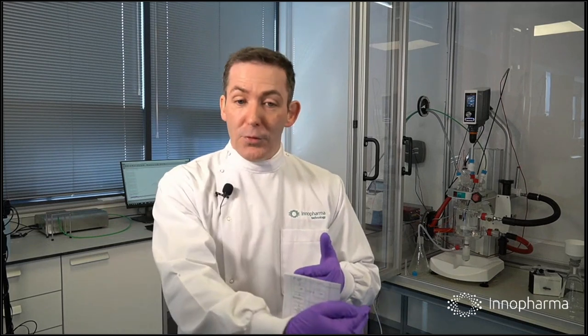And now Lisa's question, is there a possibility of the physical probe triggering more crystallization around the probe? Absolutely, yes. If it is a light probe, can it be done through the vessel? Yes, and we'll come to that demonstration later, particularly in the case of near-infrared. Other spectroscopy techniques are problematic in this regard, but near-infrared, for example, can be used to deliver light through glass and collect light again. And we'll have more detail on that in a moment. It is absolutely not a silly question. There are no silly questions, but that's a really interesting and challenging one.